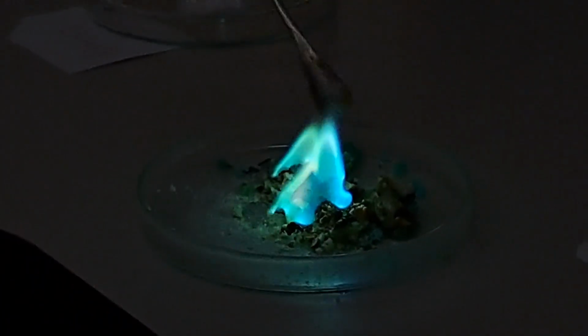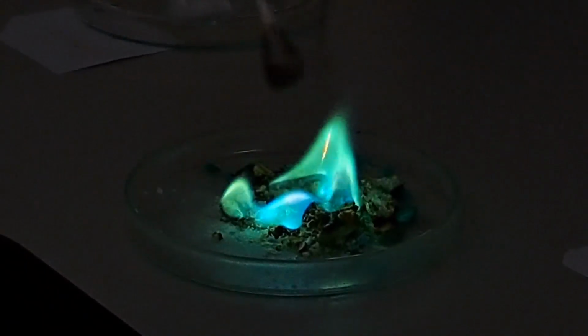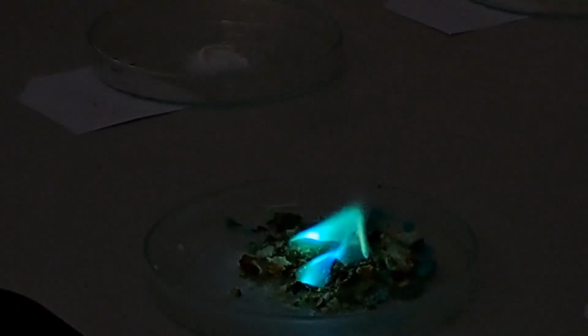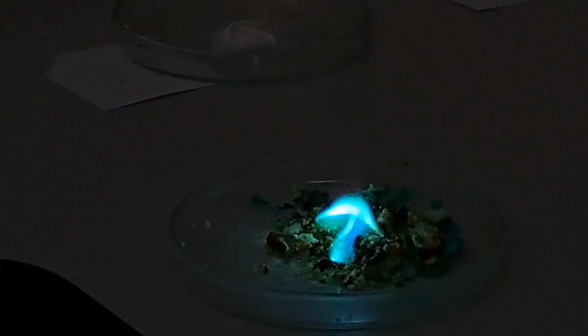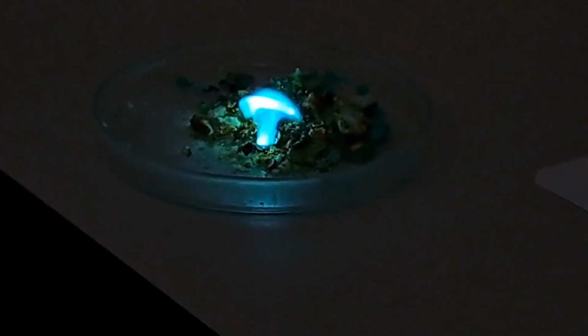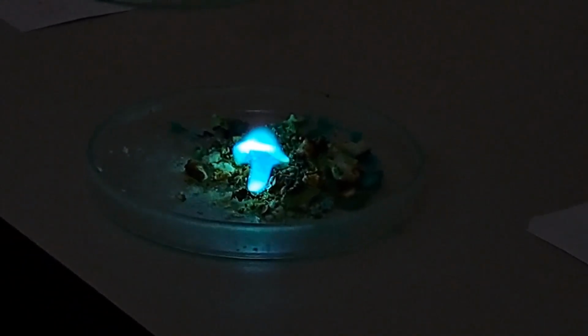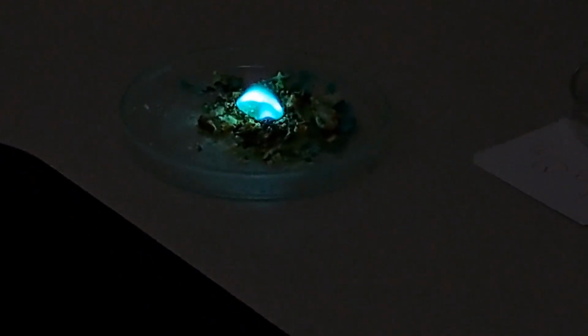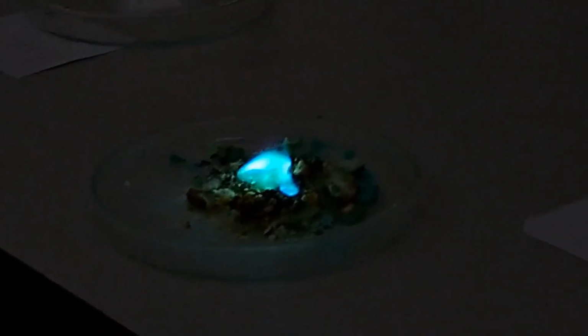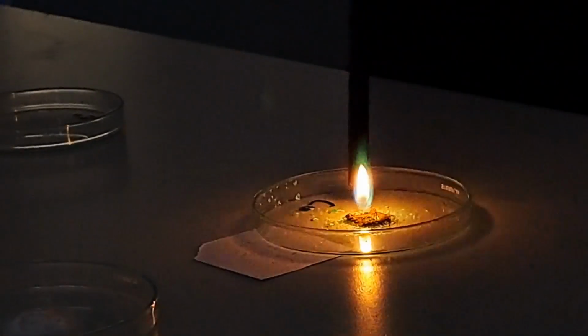If the Statue of Liberty were lit on fire, would it be green? It's made from copper. It has copper as a compound, but not pure copper; it's bronze. This is also not pure copper, it's copper chloride. Bronze is copper with some other metal. If you light it, it's on fire. Does it show green? Yes, a little bit green.